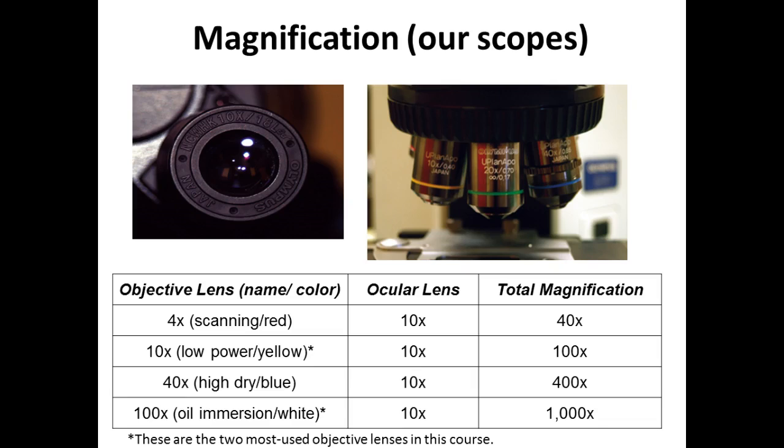So in order to keep it smoothly moving through the lens, through the slide to the next lens, we put oil, which has the same refractive index as the slide, but oil, as you know, is movable. So that oil is going to fill the gap, and it's going to help bring that light in so you can see and focus.